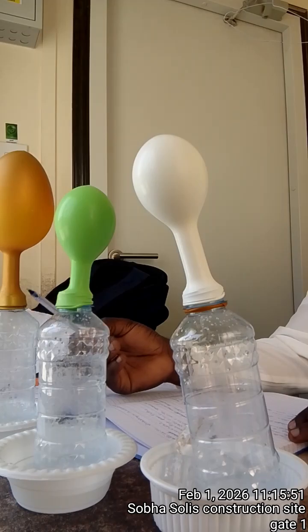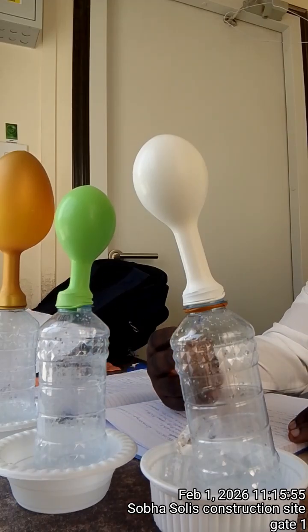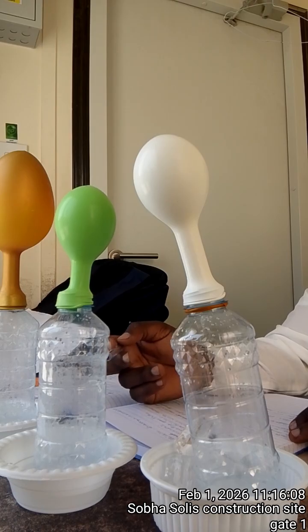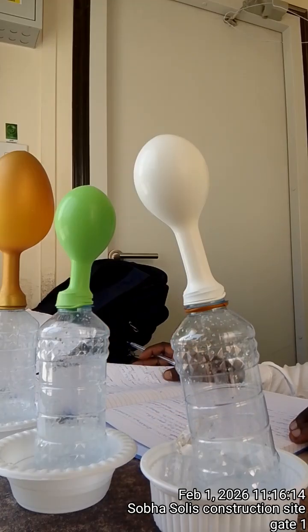So when you look at this one, it is bigger than this one, and this one is slightly bigger than this one, because this one has lower temperature. This is the 5 degrees. This one has moderate temperature, so it has a moderate reaction. Very slow, not fast, not too slow.